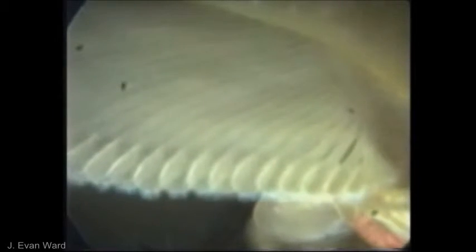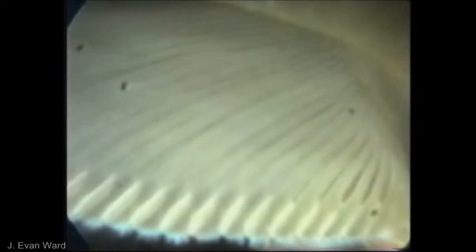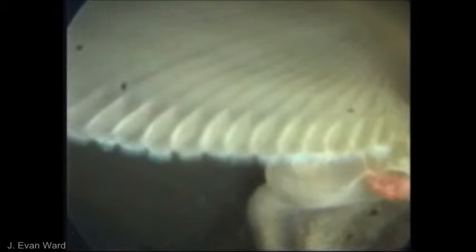The movement of mucus strings down and across the gill results in the appearance of a mucus net. We are now looking at the distal edge of the gill; the abfrontal side of the individual filaments is now visible. The edge of the gill is inserted into the neck canal, which receives particle-laden mucus strings from the frontal surface. Note the red strings coming off of the gill and the bright red food cord that is held in the neck canal. As the gill moves away from the neck canal, we can see a portion of the food cord being transported anteriorly in the canal.